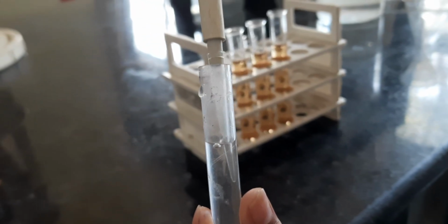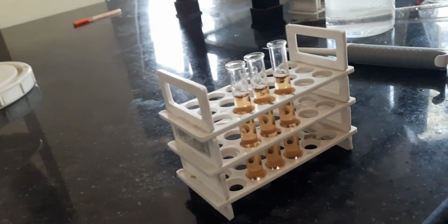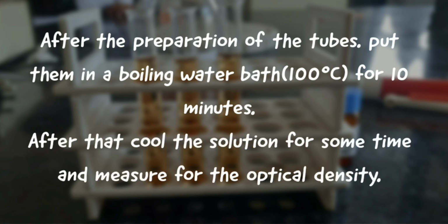For the next step, we will be needing distilled water. We need to take 50 microliters of the distilled water and put it into the test tube labeled as blank. After the preparation of the tubes, put them in a boiling water bath at 100 degrees Celsius for 10 minutes. After that, cool the solution for some time and measure the optical density.